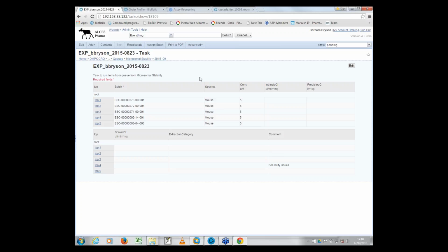We've done it with various different types of ELN, the BioVia Workbook, the e-workbook, and e-notebook and other ELNs as well. In those cases, it passes the sample numbers and the conditions that we will run at, and allows them to run their protocol to generate and collect the results and pass them back.